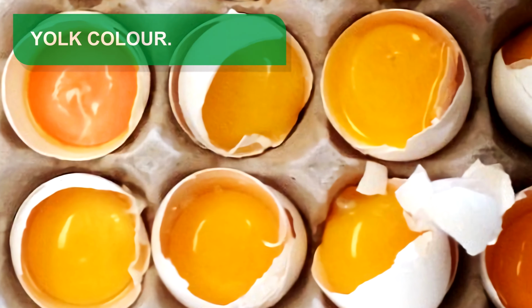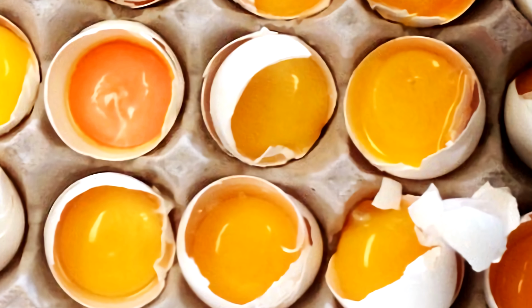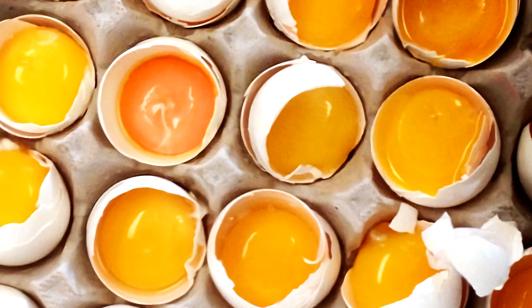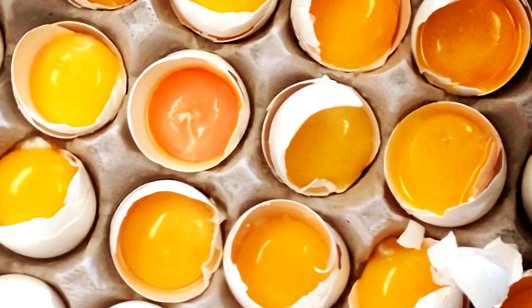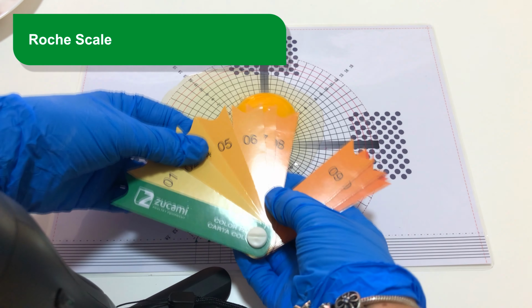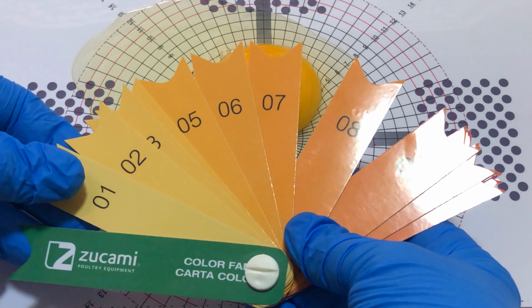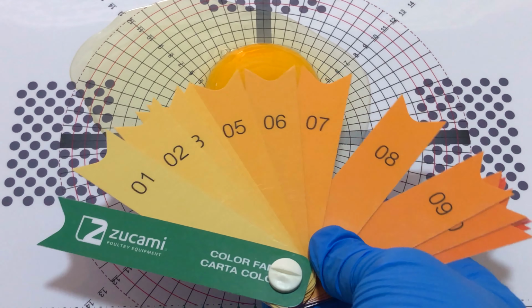Yolk color. The color of the yolk is mainly due to the carotenoids provided through the feeding of the hens. For this reason, depending on market preferences regarding the color of the yolk, we can adjust its incorporation into the diet of the birds. The most widespread method to measure the color of the yolk is the use of the Roche scale. It consists of contrasting the color of the yolk with a range of colors made up of 15 pre-established values, which go on an increasing scale from pale yellow to reddish orange.